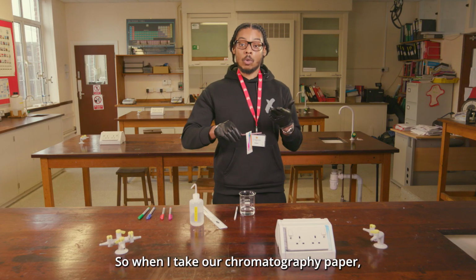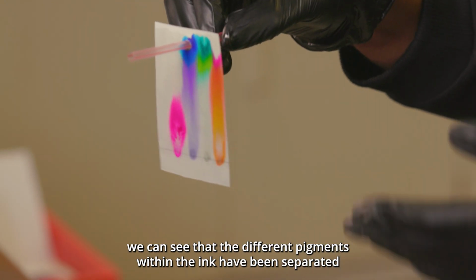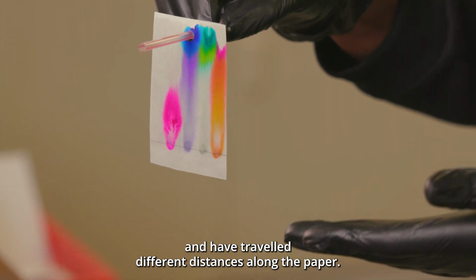Right, so when I take out the chromatography paper, we can see that the different pigments within the ink have been separated and have travelled different distances along the paper.